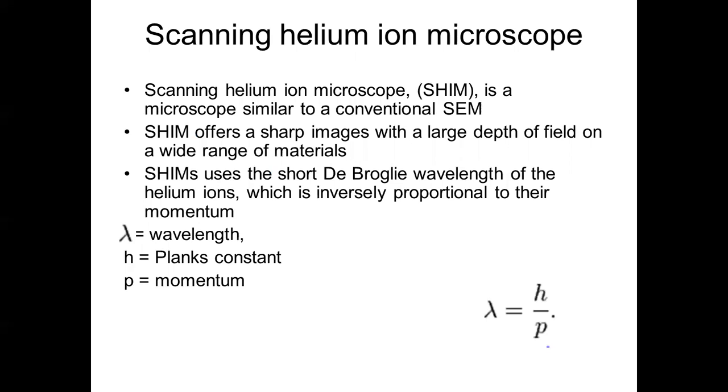So let's take a look at the scanning helium ion microscope. People call this SHIM or SHIM's technique. It's similar to a conventional SEM, but what SHIM offers is increased sharpness with a larger depth of field on a wide range of materials.